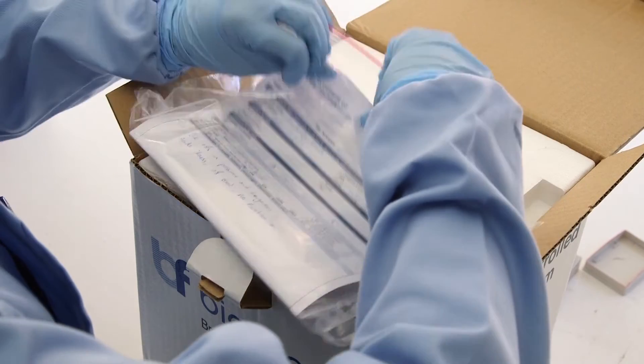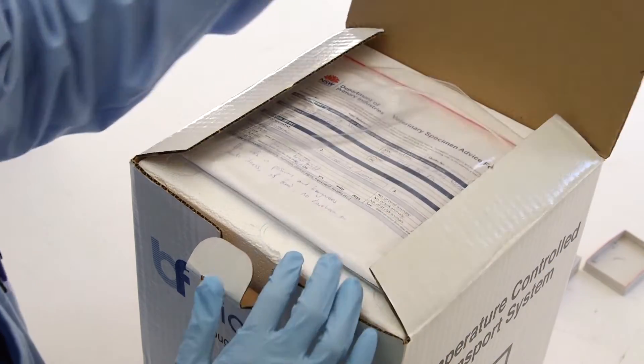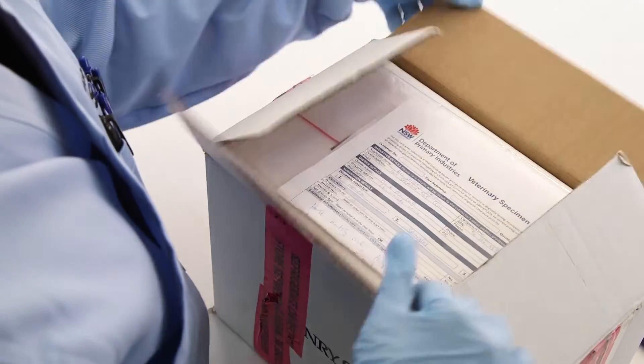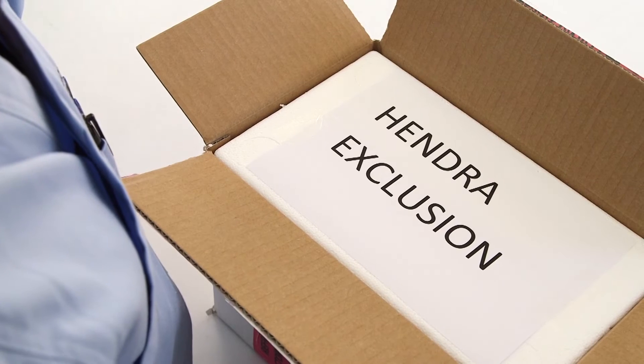Finally, put the secondary packaging into the outer packaging ready for transit. Common examples of outer packaging include cardboard boxes or eskies. Samples submitted for notifiable disease exclusion must be packaged separately to other specimens with the specimen advice form on top of the secondary receptacle and a warning label clearly visible.